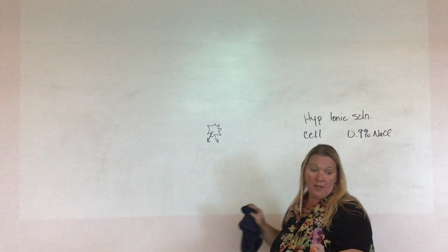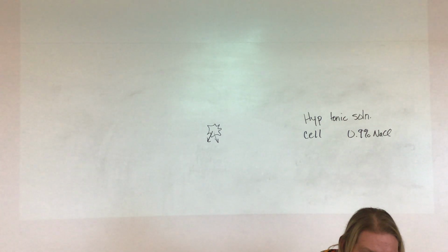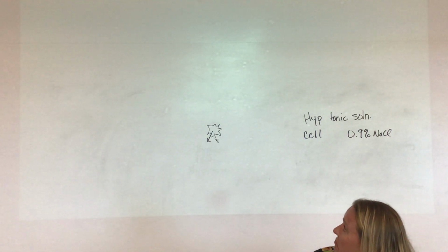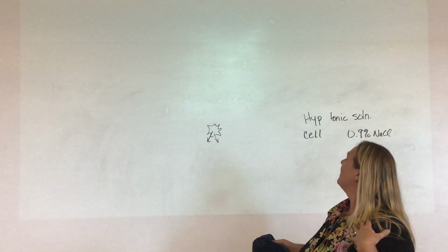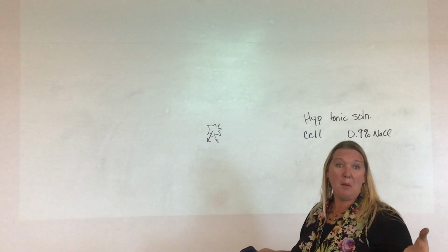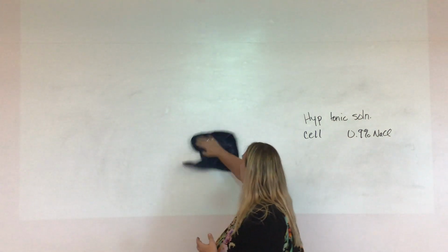Alright, I have it on there. And it's on the slide, and if I continue to look around, maybe right there's some debris. Where did the cells go? I didn't all of a sudden forget how to use the microscope, right? They're on the same one. So where did they go?